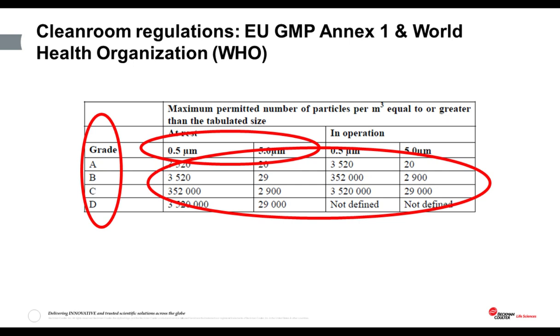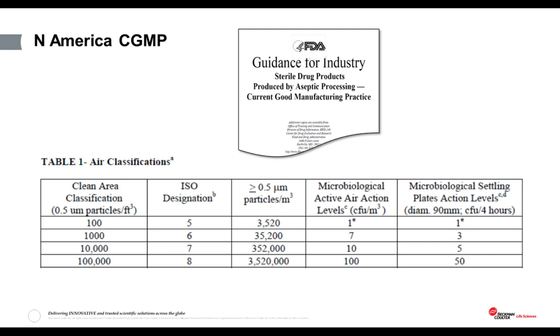Now, it is true that most particle counters can be programmed to automatically make this calculation for the user, but it's another configuration step to remember to do to ensure the results are reported correctly. And I have seen people not doing that and just writing down the counts per cubic foot.